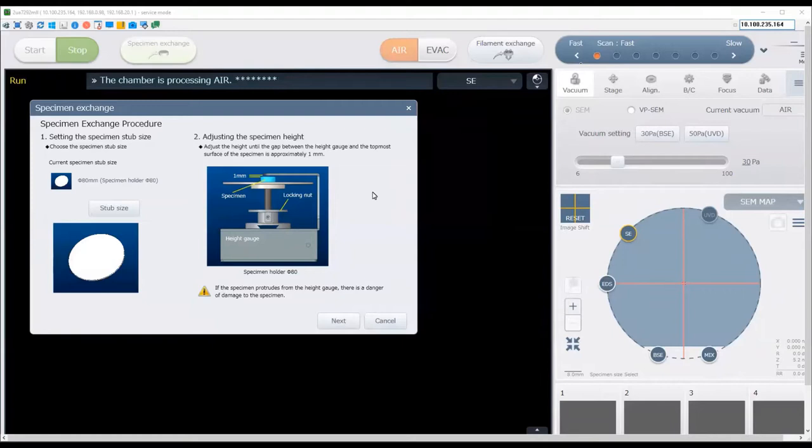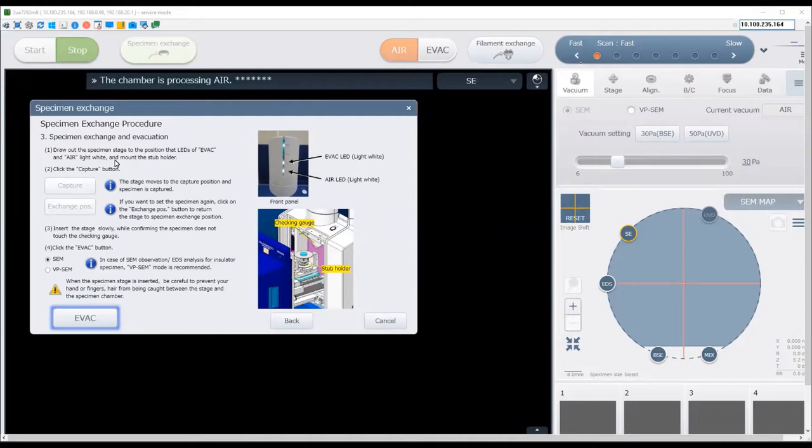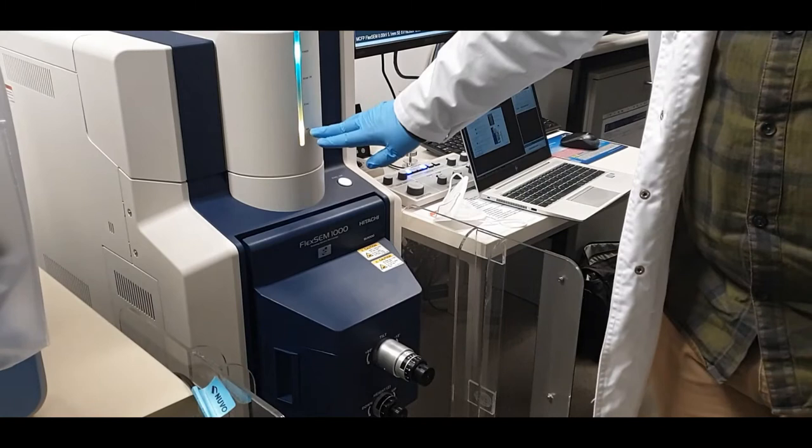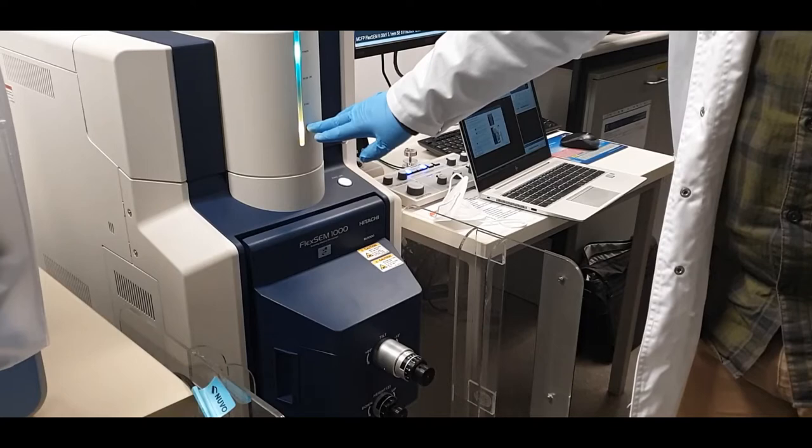You will see a specimen height diagram, which is a reminder of the process we followed to mount the samples — set the specimen height one millimetre from the top of the height gauge. Assuming you have done this correctly, click next. Now wait for the chamber to be completely vented. Once the air light stops flashing and you hear three beeps, the instrument is ready for you to open the door.